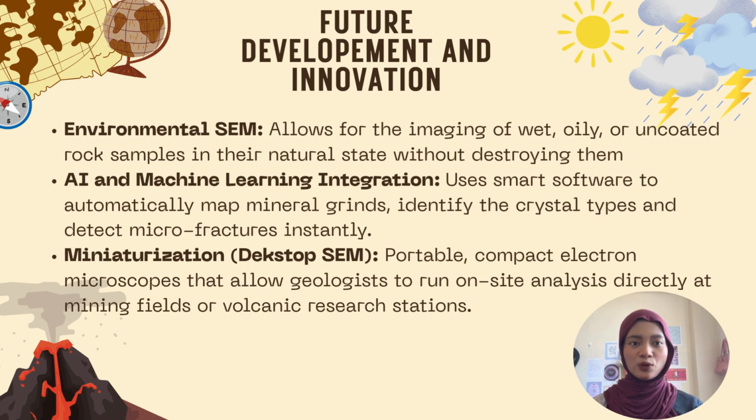The first big innovation is environmental SEM. Unlike traditional vacuums, ESEM allows us to image wet, oily or completely uncoated rock samples in their natural unaltered state without destroying them. Next is AI and machine learning integration. By using smart software, the system can automatically map mineral grains, identify crystal types, and detect microfractures instantly, saving researchers hours of manual labor.